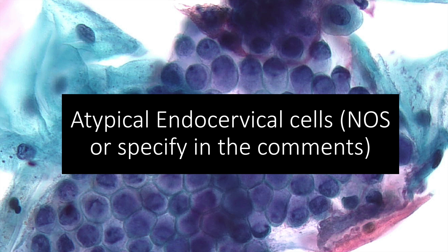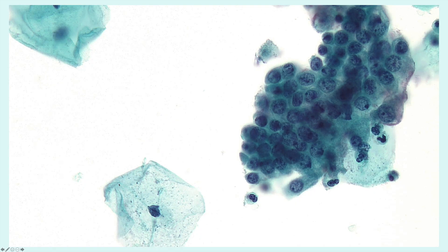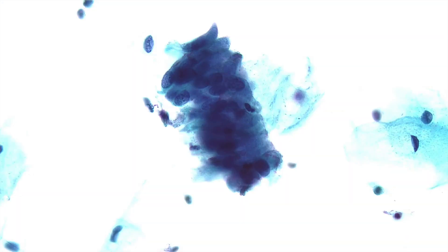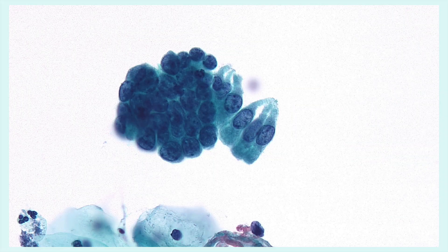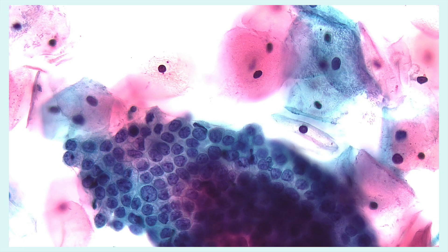Atypical endocervical cells occur in sheets and strips with some cell crowding, nuclear overlap, and/or pseudostratification. Cytoplasm is still abundant but the nuclear-to-cytoplasmic ratios are increased. You can have nuclear hyperchromasia, mild chromatin irregularity, and still distinct cell borders. In liquid-based preparations, groups are more rounded and more three-dimensional. You can have variation in nuclear size and shape, nuclear enlargement up to three to five times the size of a normal endocervical nucleus, occasional nucleoli, and rare mitotic figures.